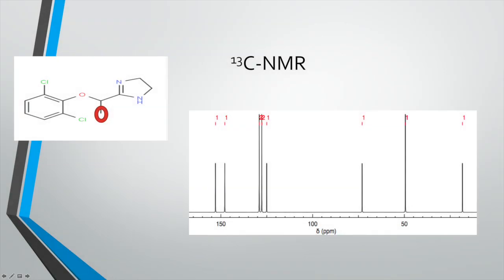For the carbon NMR, the first carbon we'll look at here falls at 18.3 ppm. The next carbon is at 49.4 ppm, and this carbon is not chemically equivalent to the previous carbon highlighted. However, it does fall in that 49.5-ish ppm range, as you can tell from the spectrum.